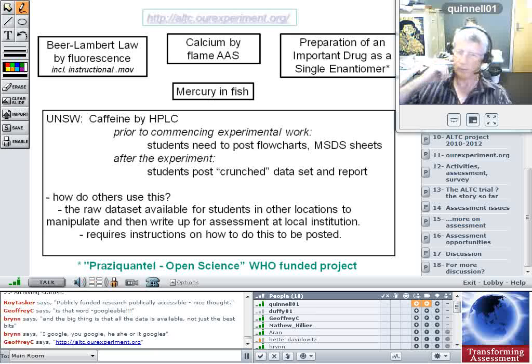The change here is that everyone knows how to write a lab report in a notebook, but when you're uploading things to the ELN, we need to make sure that the students get clear instructions on how to do that. It's just the same sort of process that we would normally go through.